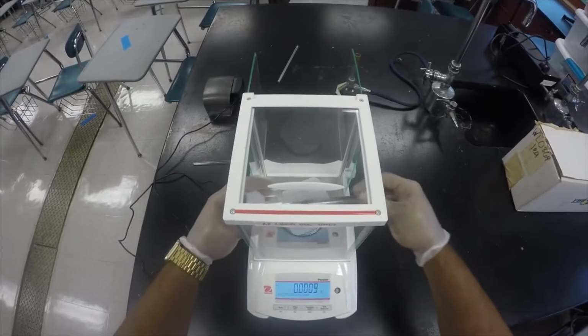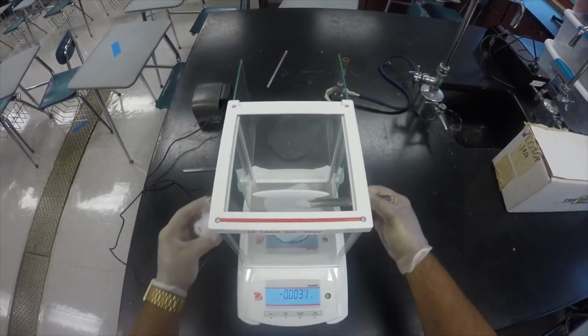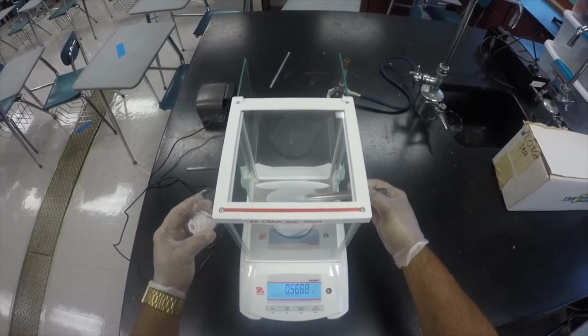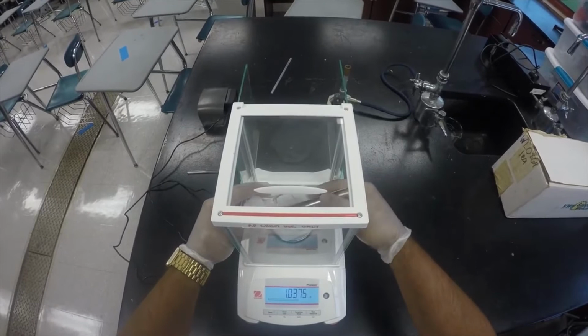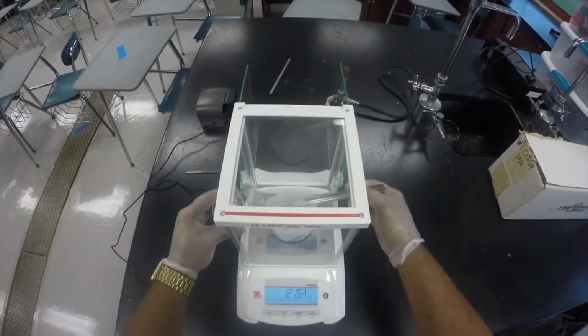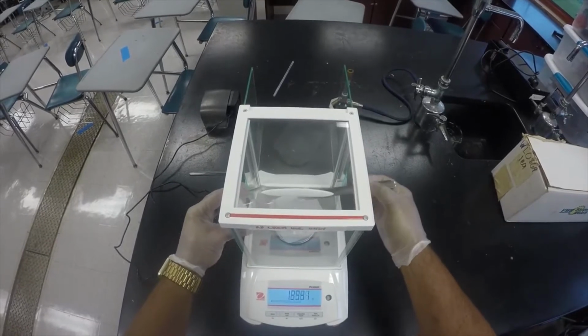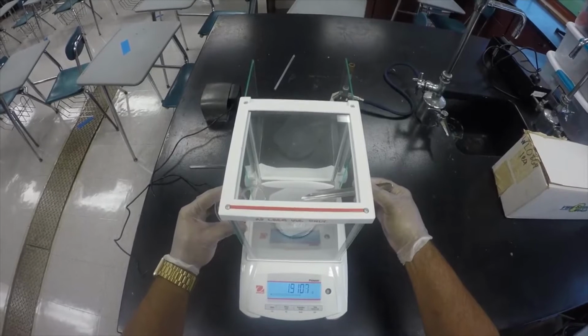Let me try to get as close to 2 grams. That's what I'm trying to achieve here, 2 grams. I'm not going to try to get exactly 2 grams. What's important here is that I can measure the mass, or know the mass accurately of the group 1 carbonate. So getting close.